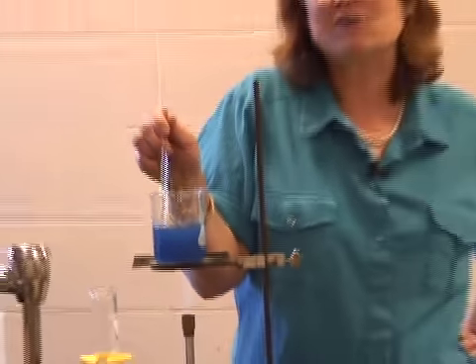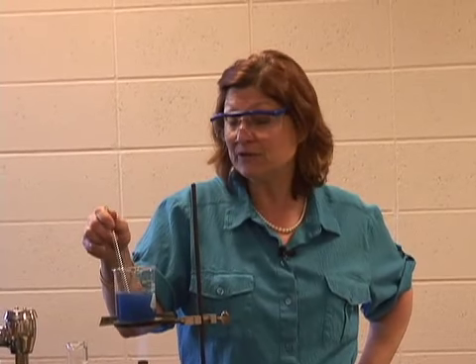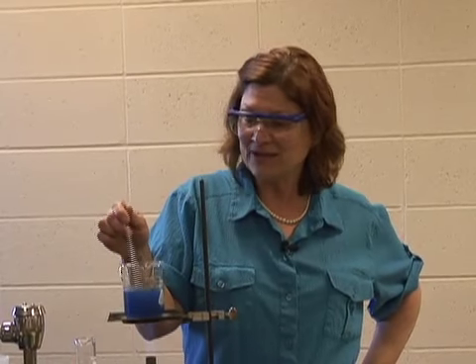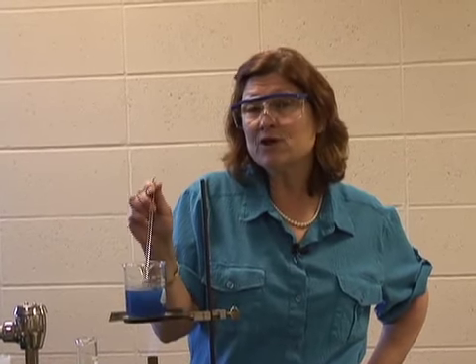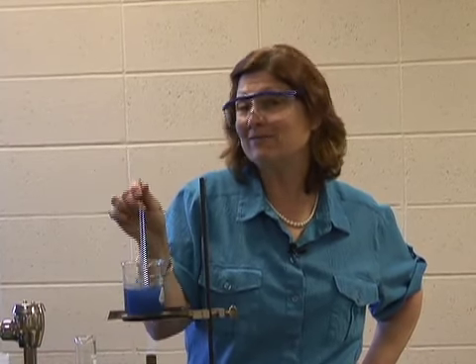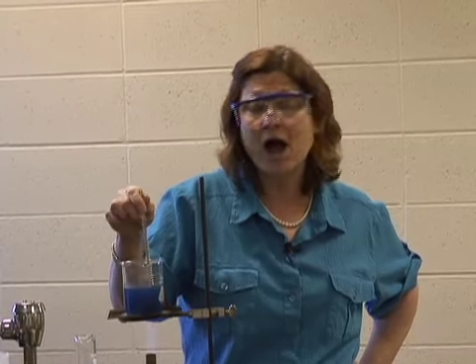And as soon as we have it all black, then we have finished as much as we need to do for today, and we will resume our lab tomorrow. So we'll just wait for it to become totally black. And a word of warning: when you use a stirring rod, notice that there are particles on the stirring rod. Therefore, I'm going to have to keep this stirring rod in the solution, or else I'll lose my copper.